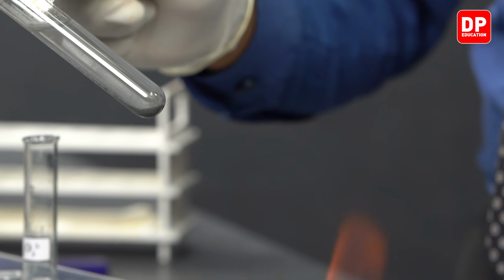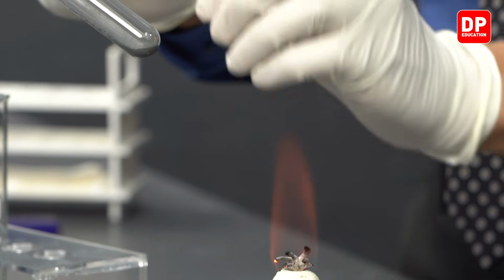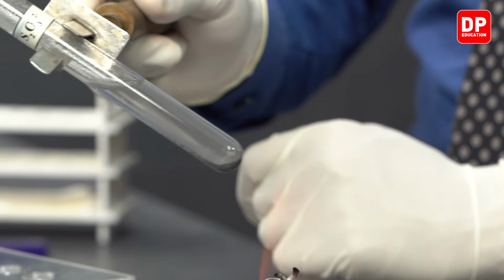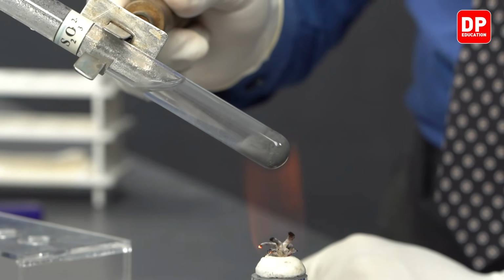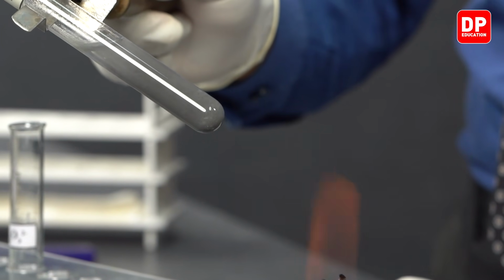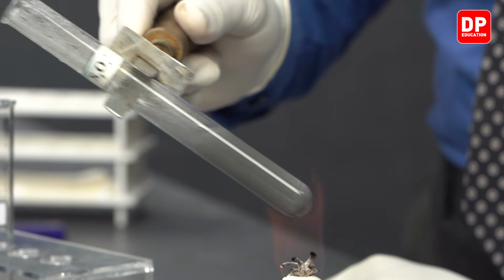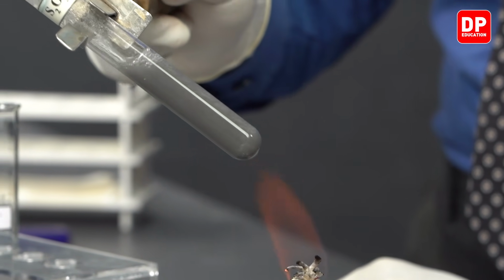As the precipitate gets mixed in the aqueous medium, you can see the very nice gray color that we observe here. So pay attention to this area. You can see how it is starting to get mixed. So you can observe the dark gray color of the precipitate here. If you keep on heating it, little by little, it will get darker and darker, and eventually you can observe the black color precipitate.